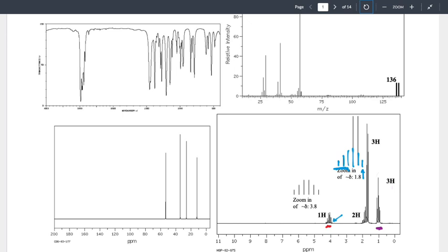It would just show an extra peak, right? Theoretically, we would see that extra peak. What am I trying to point to with my blue arrow out here? There's that extra peak. How tiny is that extra peak when we had 6 peaks? It's pretty small, isn't it? Do you think that extra peak could fit in that space? Probably not, no. It's really just a question, right? Some of that's just going to come with experience behind it.